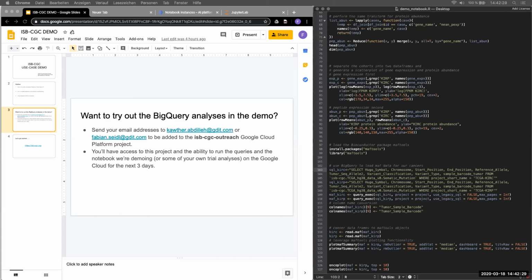I think one of the real benefits too is that you can access Google BigQuery through a whole bunch of different interfaces. There's a Python library, there's an R library, there's the command line interface too, just a bash interface. So it should be possible, as long as you have a Google login, for your users to access these tables from any sort of interface that they may be choosing, or that they may want to use.